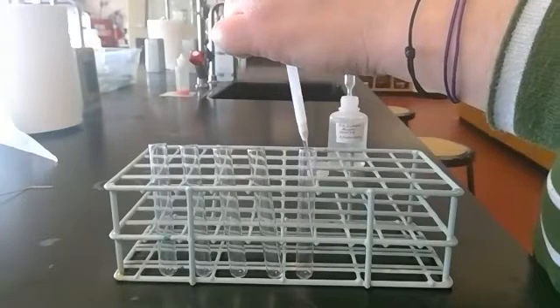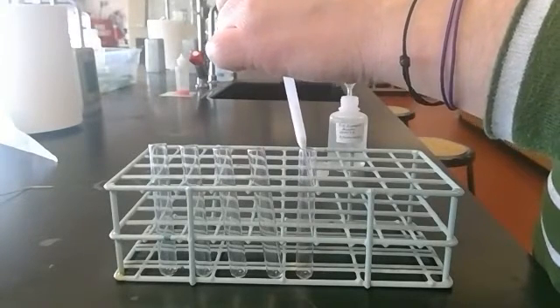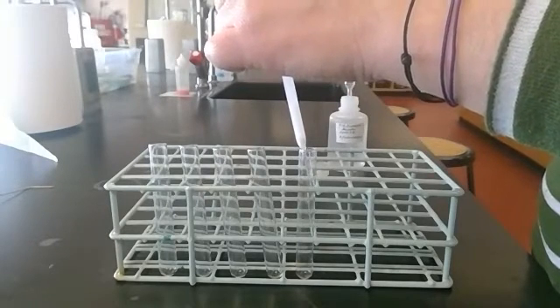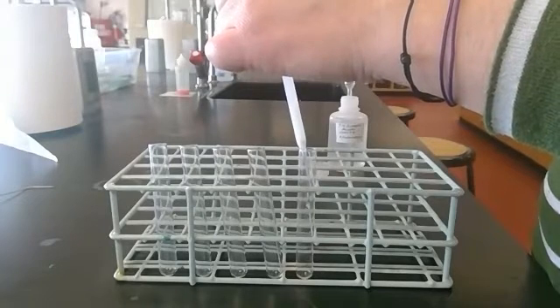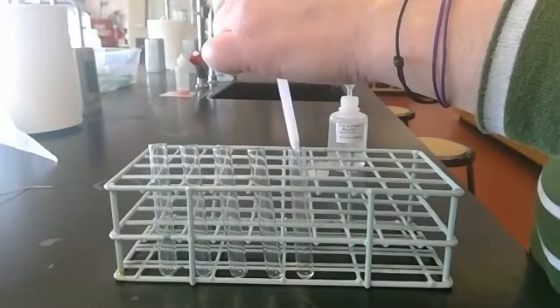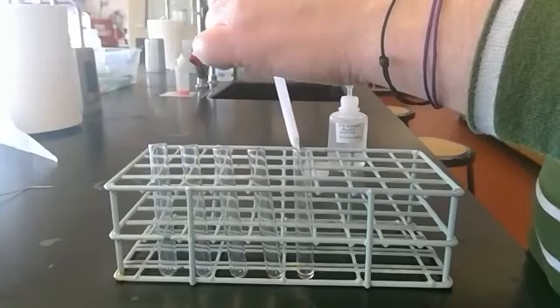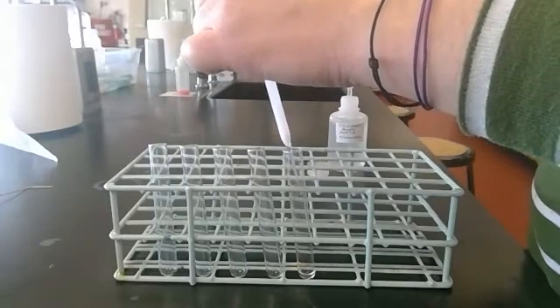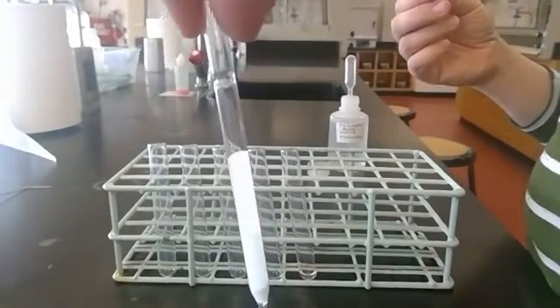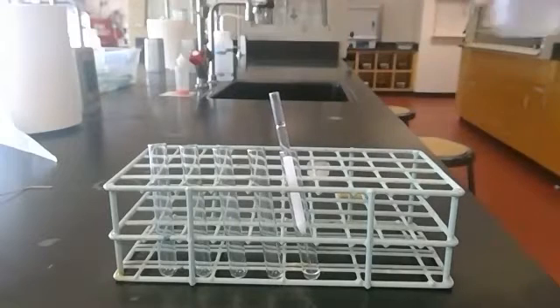And then you can see the solvent is going to move through it a little faster. So it's kind of like high pressure column chromatography. I'm going to be really careful not to pull this bulb off suddenly, so that way I don't make this kind of a mess. I'm going to do this until all of my 90% isopropanol is in the column and there's none at the top. Because the next step of preparing this is going to be to load it, is one phrase.